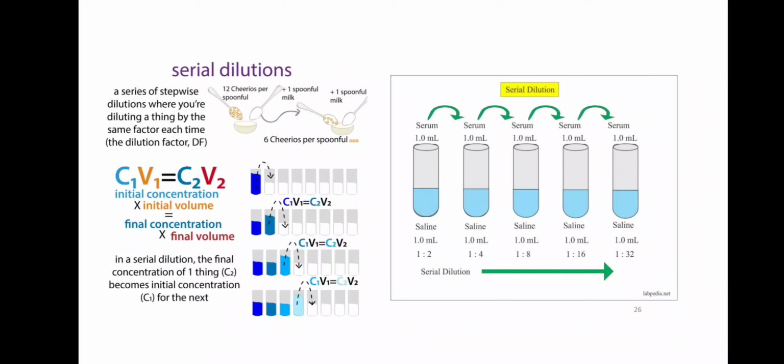Here we discuss the importance of serial dilutions in HPLC analysis. In our caffeine study, we performed serial dilutions of diet sodas to determine their caffeine concentration. By creating a series of diluted samples, we can establish a calibration curve relating the HPLC signal response to the actual caffeine concentrations in the diet sodas. This enables us to accurately quantify the amount of caffeine present in these beverages.